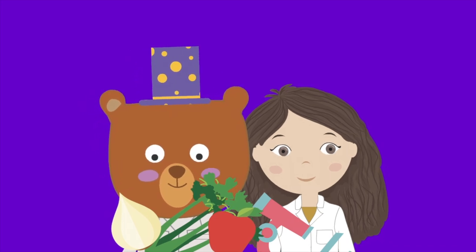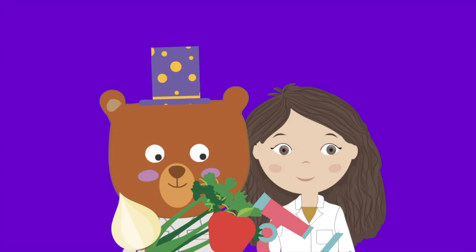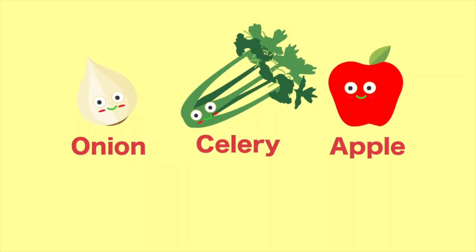Today we're making fruit and vegetable microscope slides with some help from happy sunshine friends. We'll be using onion, celery, and apple.